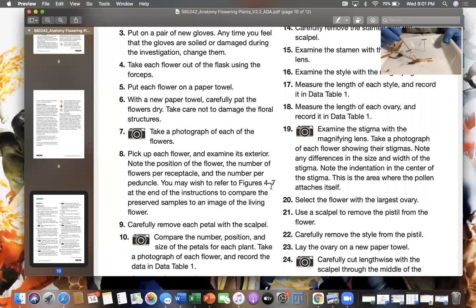If you cut down into this area, what you'll see is the stamens kind of tuck into the surrounding tissue. But the style, get that and pull that out without pulling out my pins of this lovely dissection dish that you were provided.